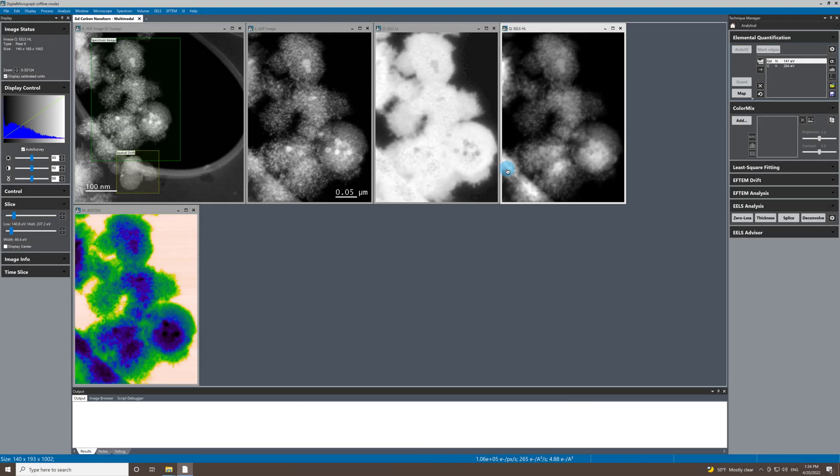Hi, everyone. In this video, I'm going to be showing the results of a low-KV multimodal spectrum imaging experiment that I performed recently using the Continuum K3 with Stellar.